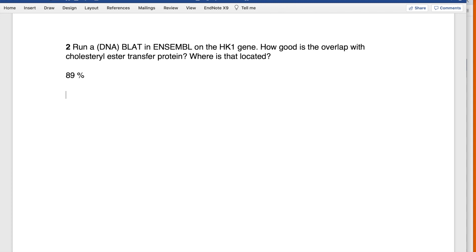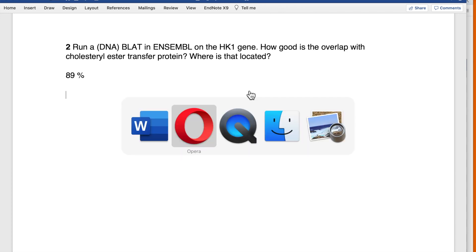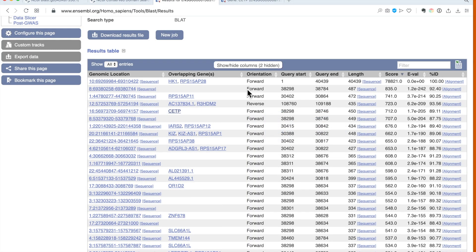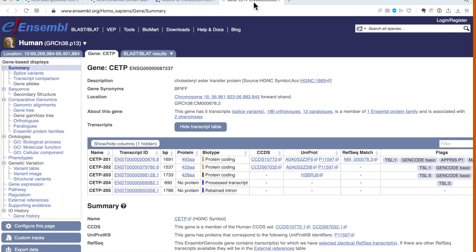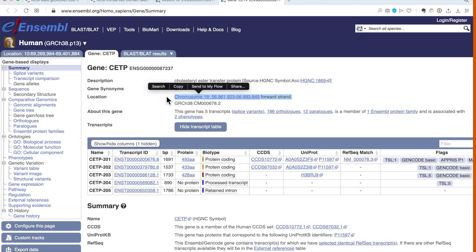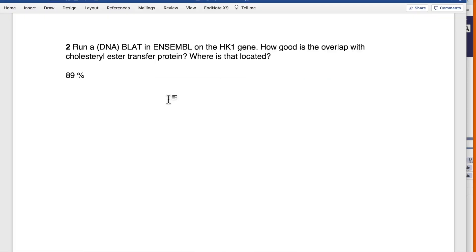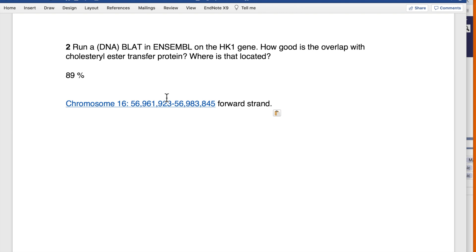Then it asks where is that located. That protein, CETP, where is it located? It doesn't say here, but we go to the corresponding entry. Under location we can see where it is. According to the current standard that's 2020, it's located on chromosome number 16 on the forward strand, base pair 56 million upwards.